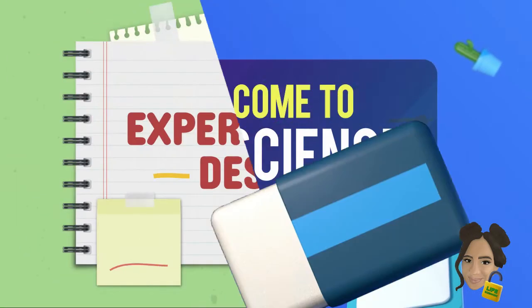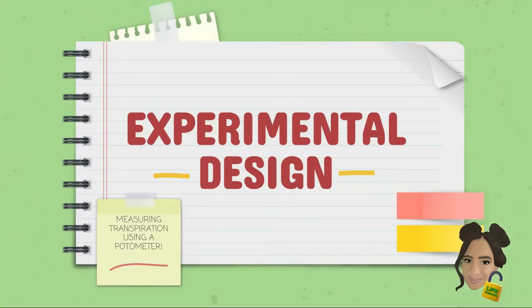Hi, and welcome to this lesson on experimental design. In this lesson, we will be focusing on measuring transpiration using a potometer.